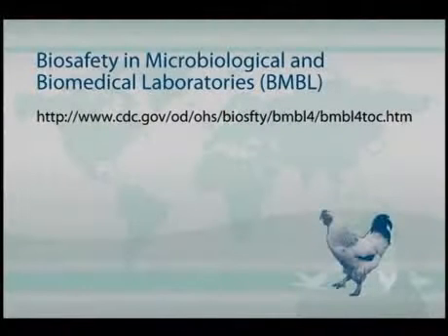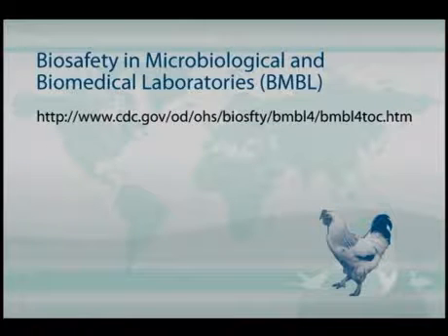Now, what I'm going to tell you this morning is really not all you need to know about safety in the laboratory. The guidelines for safe work in the laboratories is really provided in what we call the BMBL. It's the Biosafety in Microbiological and Biomedical Laboratories. And I have provided a website for you to download this particular document. This is the 4th edition.